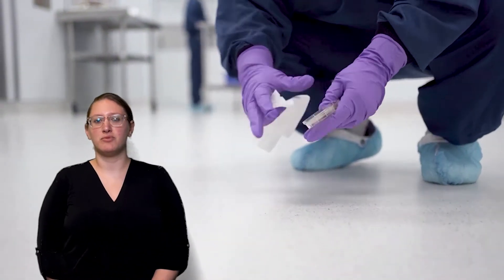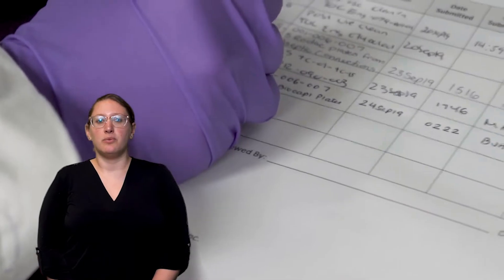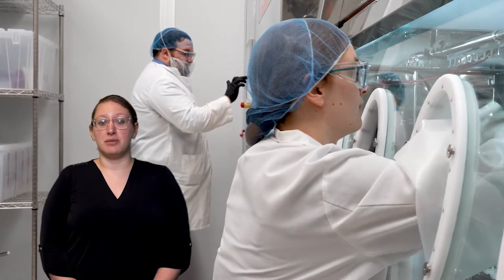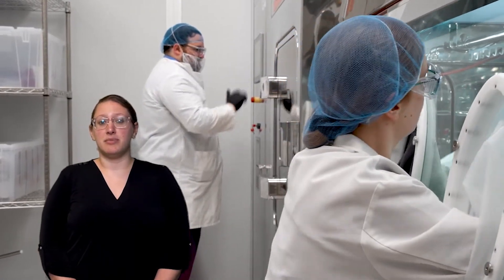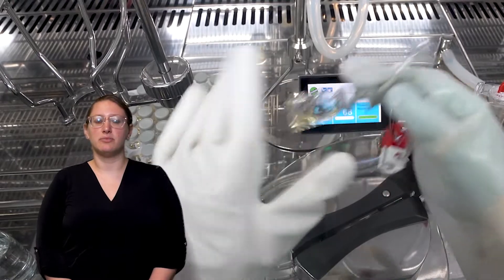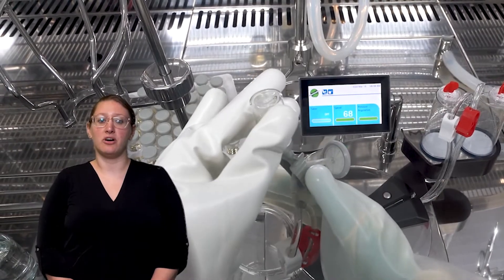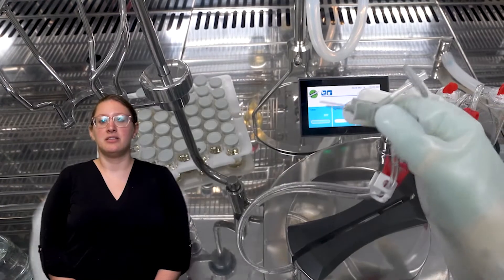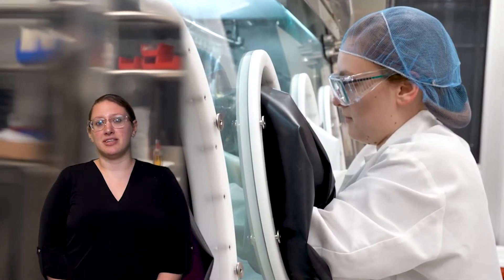Hi, I'm Lindsay Lundgren, the Manager of the Microbiology Department at BSM, and I've been with BSM for four years. At BSM, we also perform testing of our clean rooms, filling lines, and water to ensure that they're all clean and well controlled. We have nine microbiologists that perform sampling on a weekly, and sometimes daily basis, to ensure that the clean rooms, air, surfaces, and water are all clean and free from anything that could make us sick. This ensures that the medicines we create are safe.